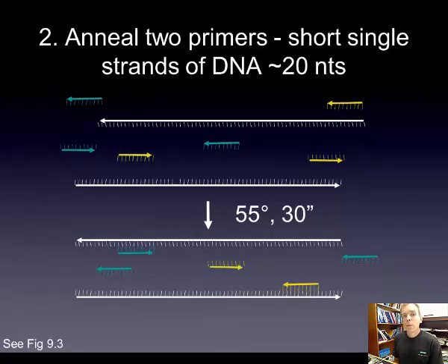At that point, small oligonucleotides, which are the primers, will hybridize via hydrogen bonding to the DNA template. These primers are not unlike the ones used in vivo, except they are synthesized chemically in a lab, so they can be designed for specific genes, as opposed to the primers used in replication in vivo, which are simply randomly generated oligonucleotides.